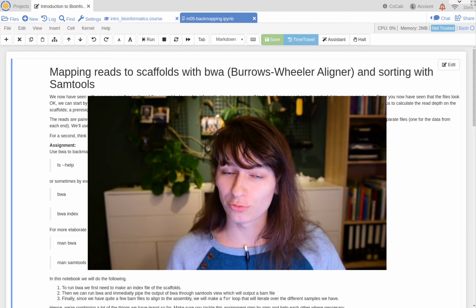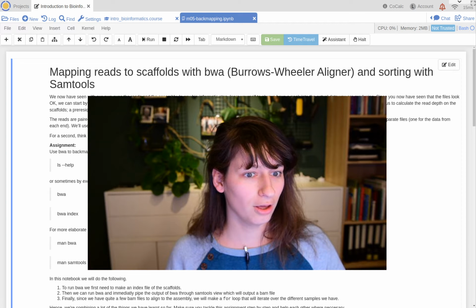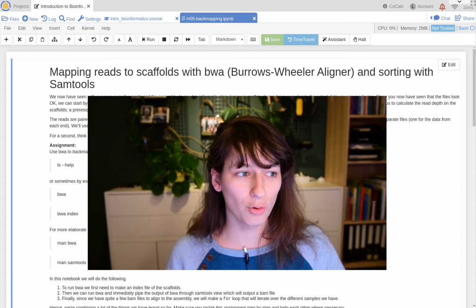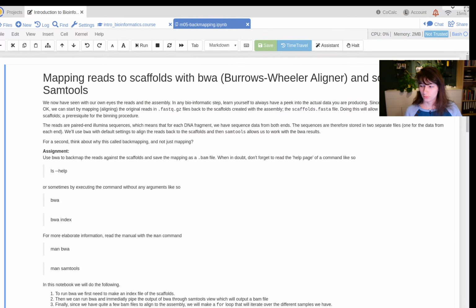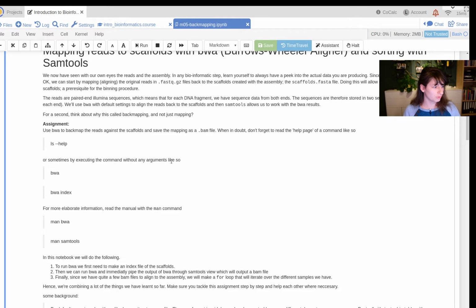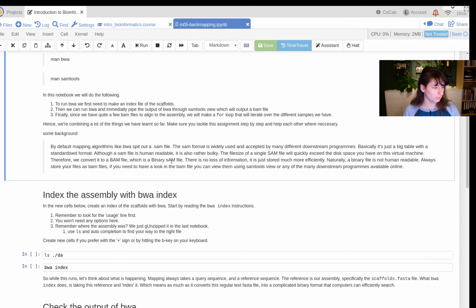This is another video for topic number 2, metagenomics, and I'm going to take you through exercise number m05, backmapping. So let's have a look at the actual exercise. One of the lessons that you will learn in this exercise is to read the manual. There's a lot of instructions at the beginning. I'm gonna skip these for now. I'm assuming you've read all of these.